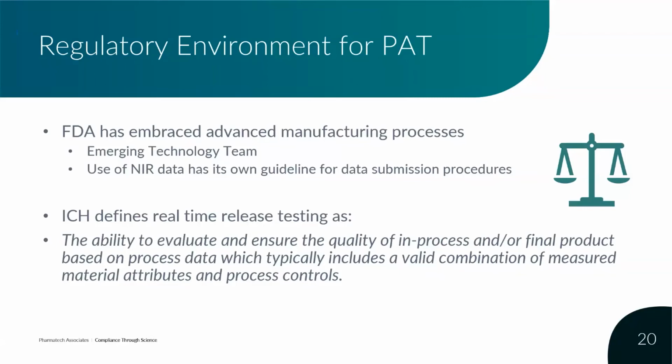Considerations regarding the cost of process analytical technology devices, equipment modification, process development, calibration model development, and validation of those models all need to be balanced against the savings that result from real-time release testing. And this will have to factor into your business decision on whether to proceed or not.